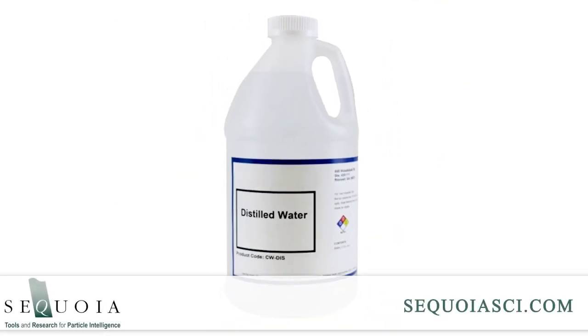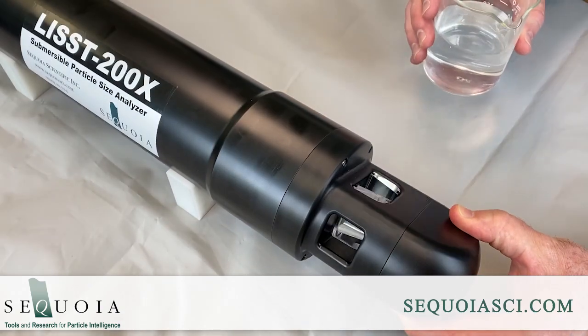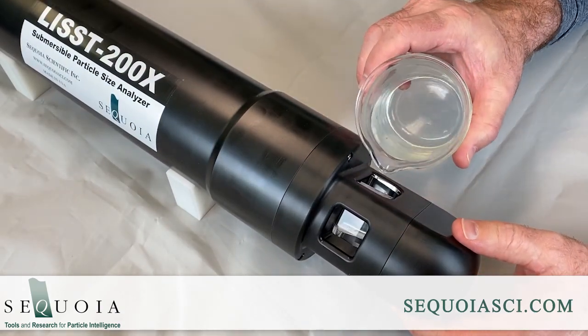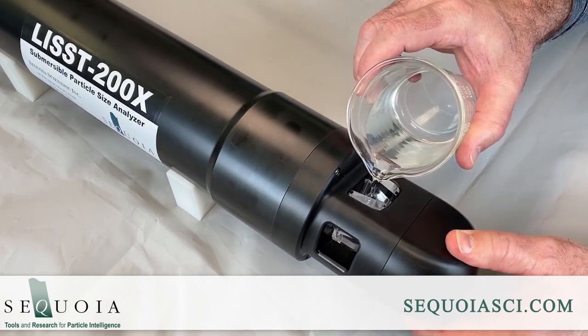Sequoia recommends steam distilled bottled water filtered through a 0.2 micron filter as the source of clean water. Tap water may contain too many particles and may also contain dissolved gas that can release and form small bubbles on the optical surfaces. Pressurized filtered water can also contain dissolved gas. Often the best source of clean water is bottled drinking water.